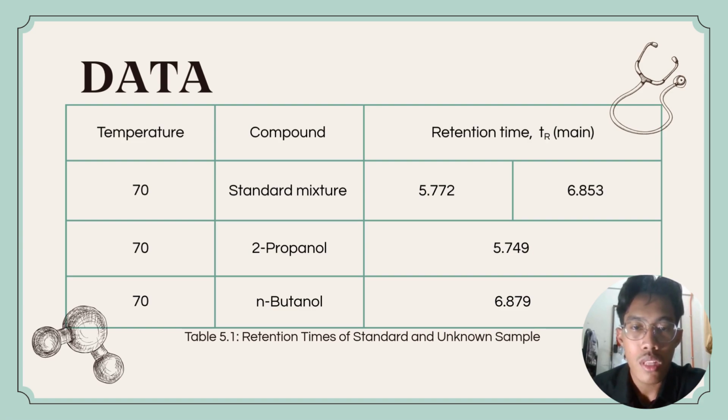Similarly, N-butanol has a retention time of 6.879 minutes, which closely matches the second peak in the standard mixture. This confirms that the second peak corresponds to N-butanol.